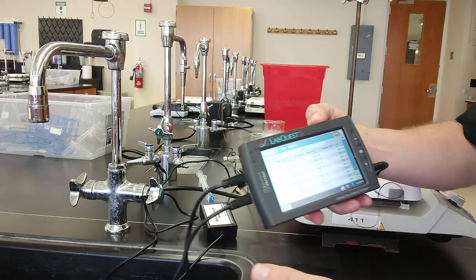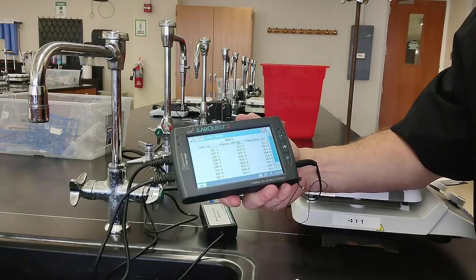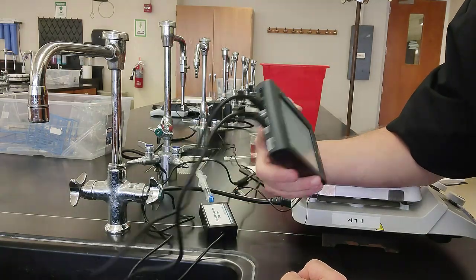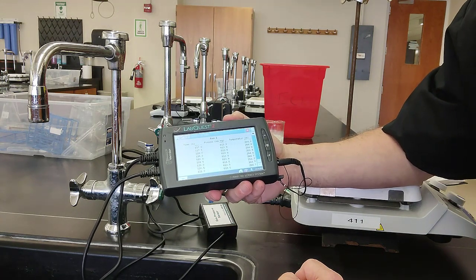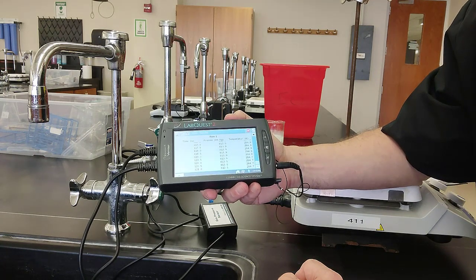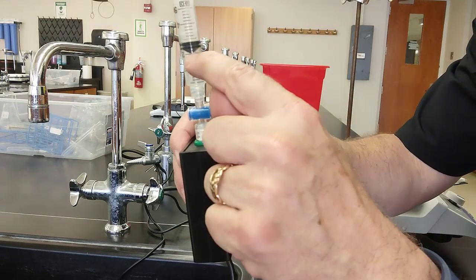So it's up to you. You can ask your instructor if they're going to want you to graph all of these data points. You could export this to a USB and to a computer and plot it all. But really what we're looking for here is not so much your graphing abilities, but our qualitative study of what happens when we change the volume.